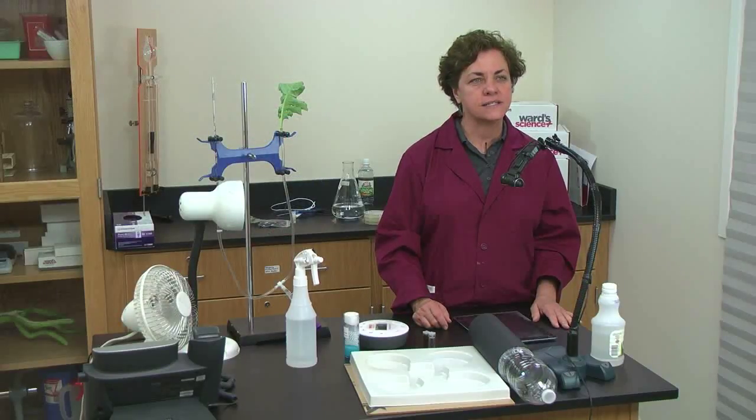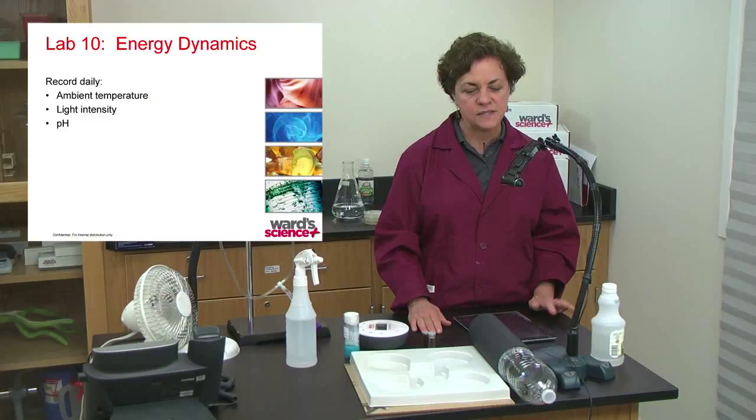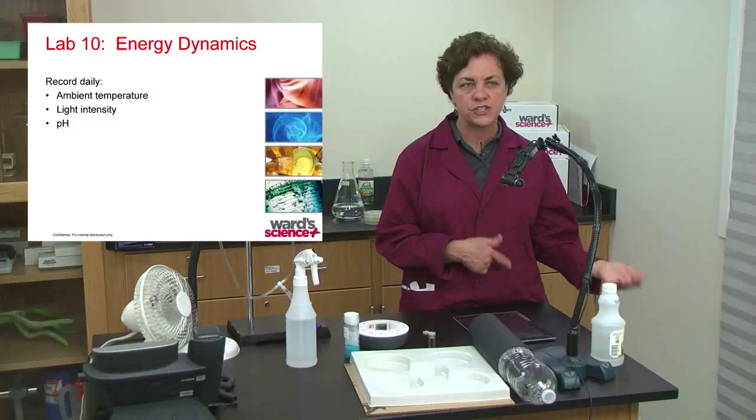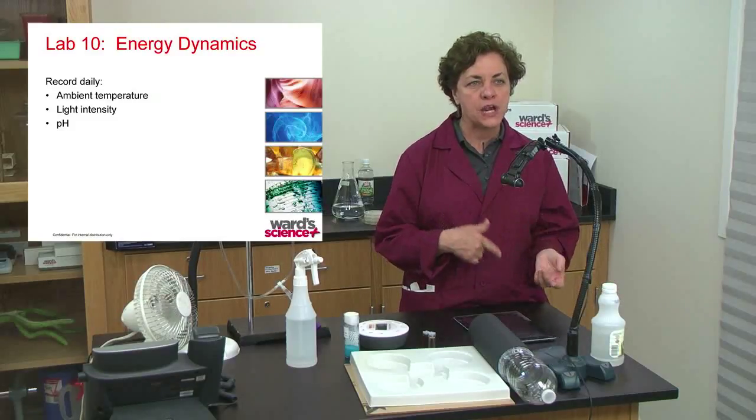And next, energy dynamics. Energy dynamics is an experiment very much like artificial selection, which is lab 1, where you're growing plants.